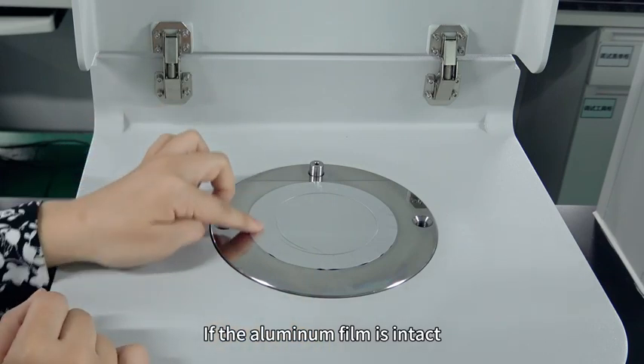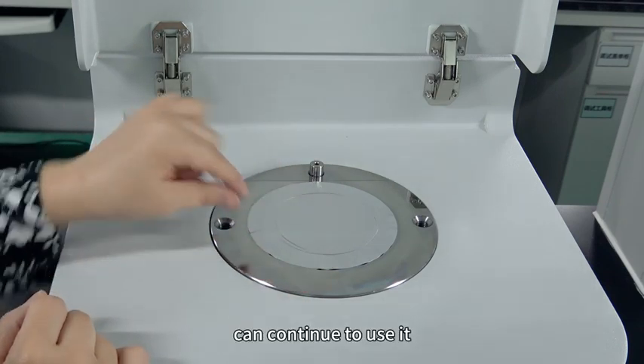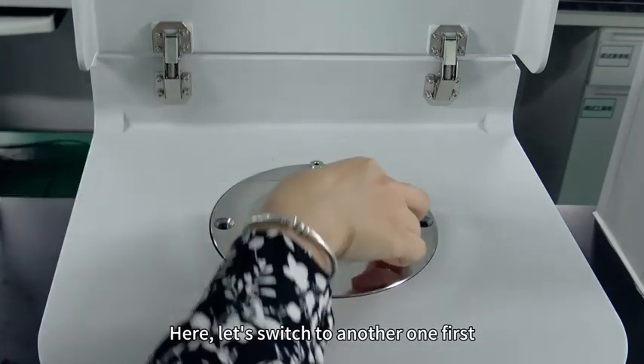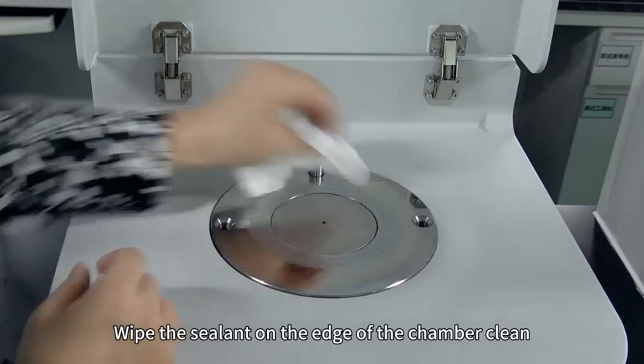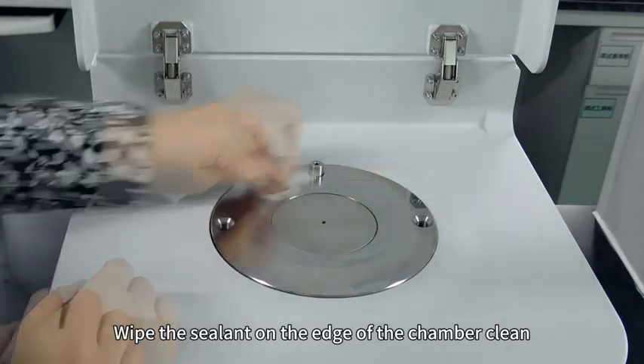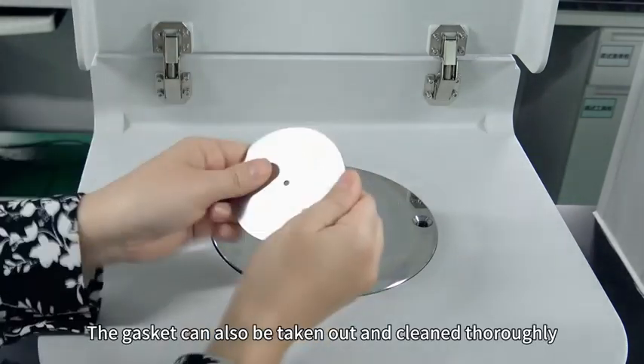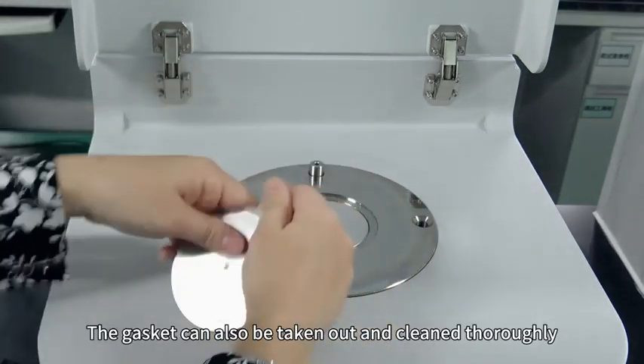If there is any air leakage or the film is incomplete, we need to replace it with a new one. If the aluminum film is intact, we can continue to use it. Here, let's switch to another one. First, wipe the sealant on the edge of the chamber clean. The gasket can also be taken out and cleaned thoroughly.